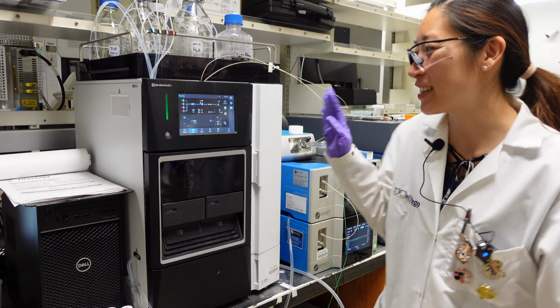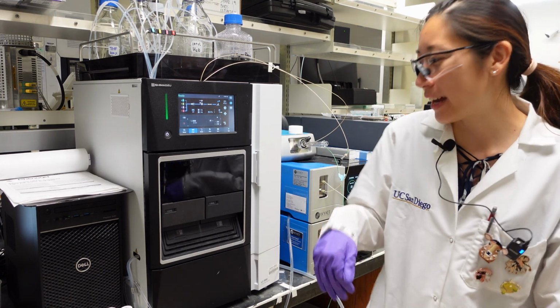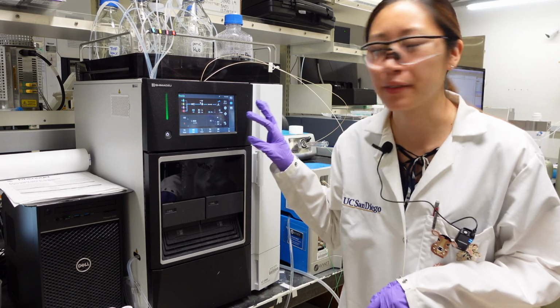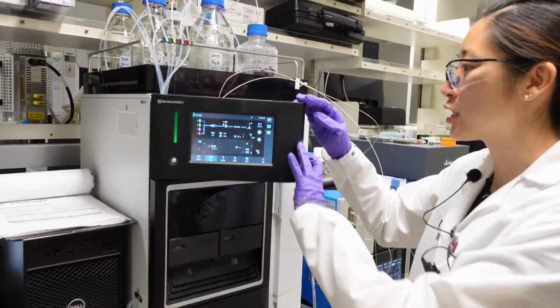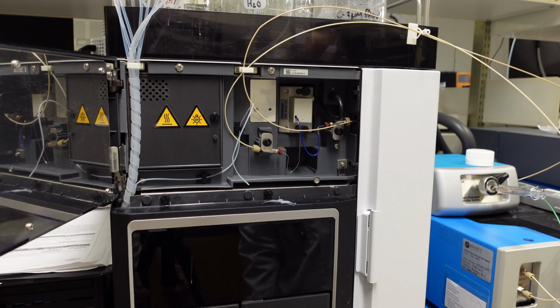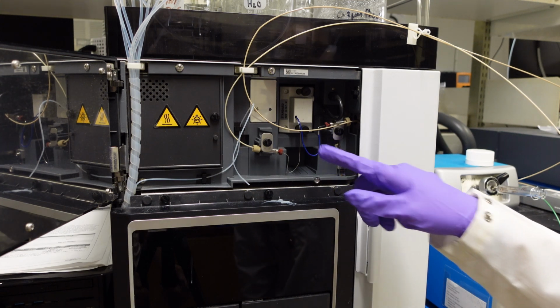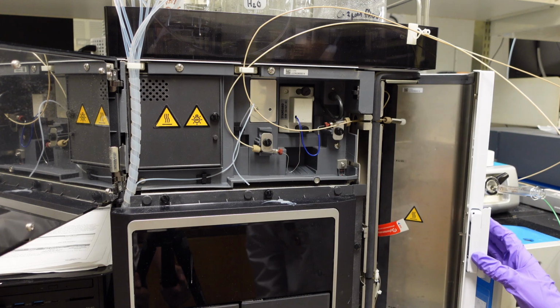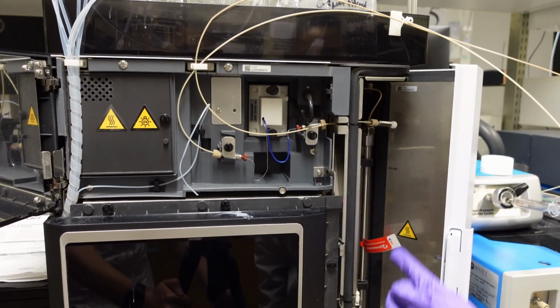Okay, so this is our GPC setup that we're going to look at today. There are a few different components that we're going to look at. This is the main control panel. If we pop this out, we have the UV detector. And then if we pop this open, here we have our column.